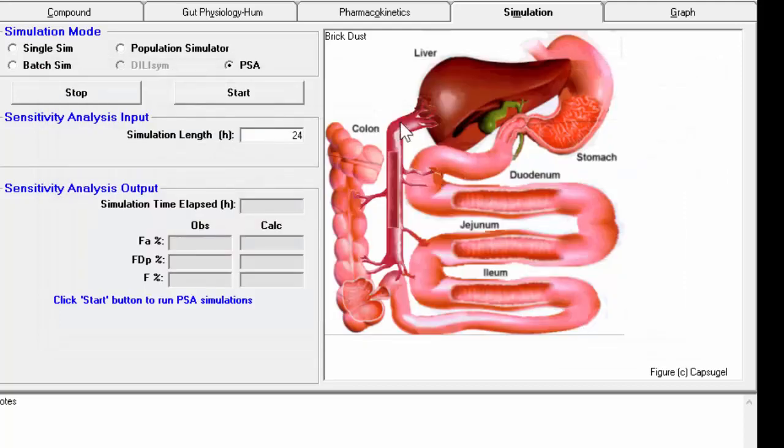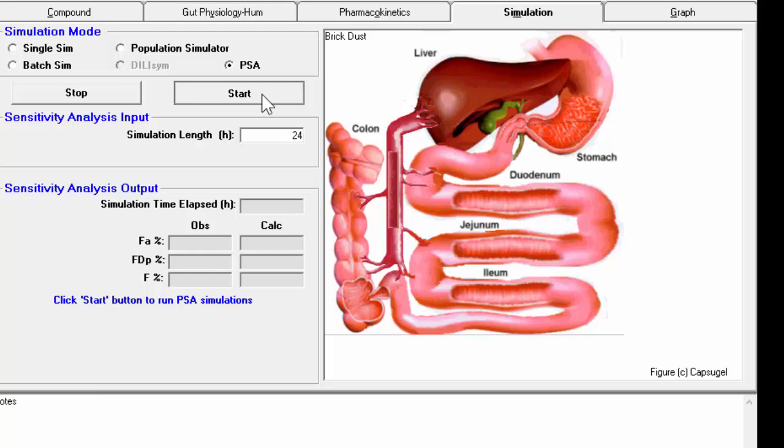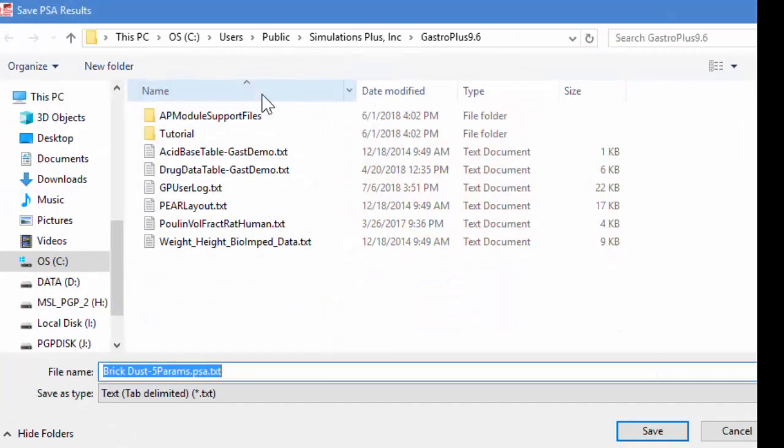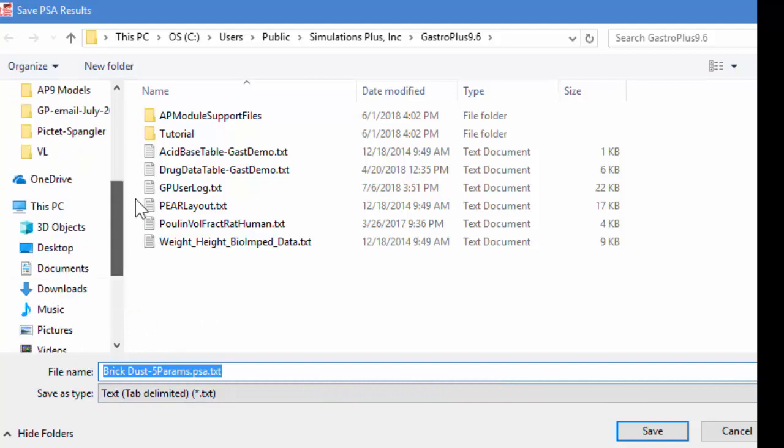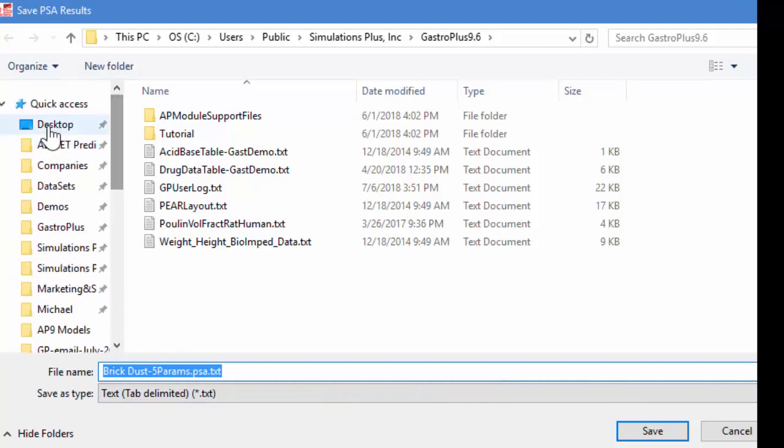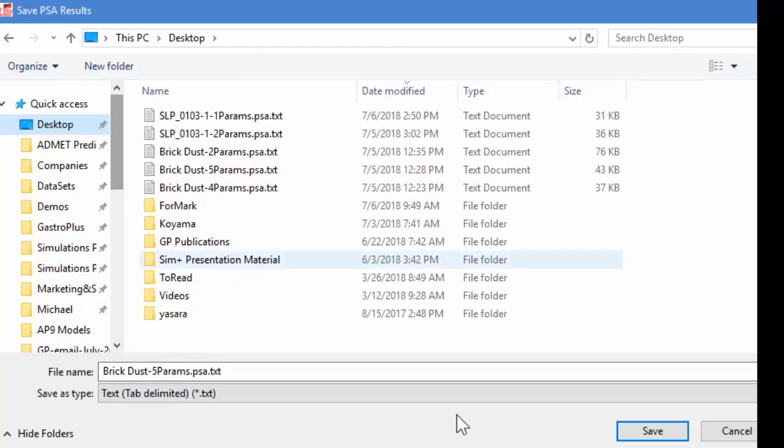And then within the parameter sensitive, back into the simulation dialog box, we would click Start. This is going to prompt us for a file name. If we save this file name, we can read it back into Gastro Plus, or we could read it into Excel and create some graphs there. So I'm just going to save this on my desktop. So I'll hit Save.